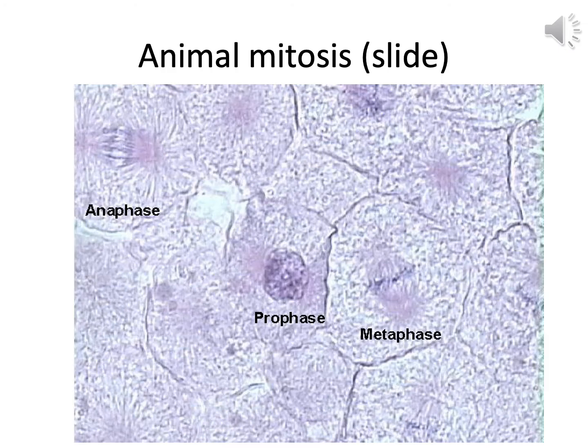In a real Biology 1408 lab, we'd have made you look at the animal mitosis slides. I always had some pictures, so here you go. You're also welcome to go to the Science Tutorial Lab, SSCI, room 1501, and look at some slides on your own. We do have the animal mitosis slides here. They're kind of hard to see sometimes.